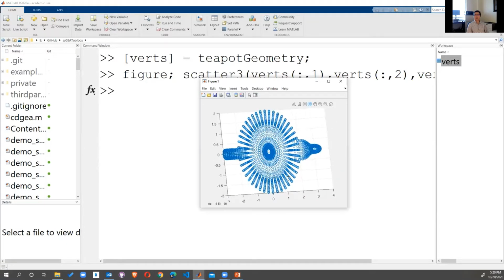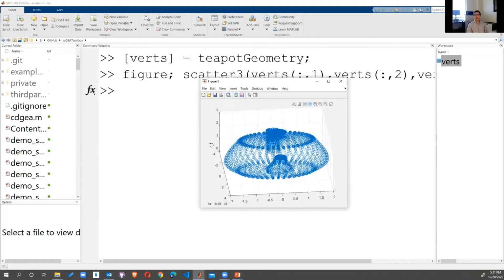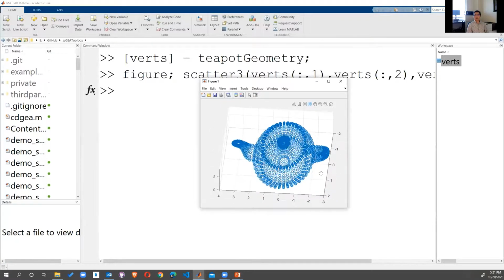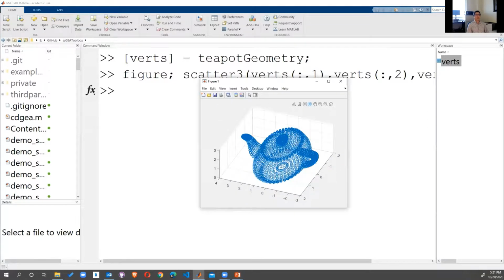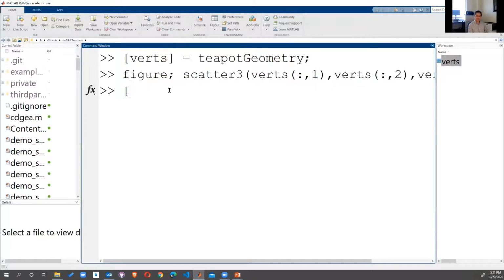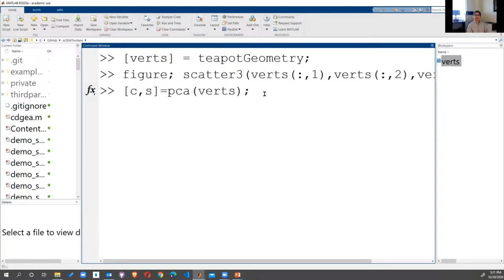Now our project is to visualize using one picture, two-dimensional, either this way or this way. There are endless possibilities to show this in two dimensions. Okay, so I will let PCA choose. This is a PCA function, a built-in function in the statistics toolbox of MATLAB.